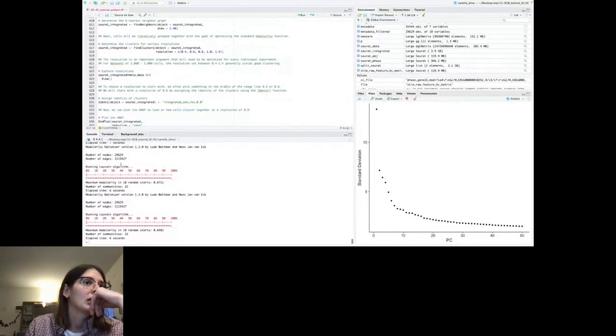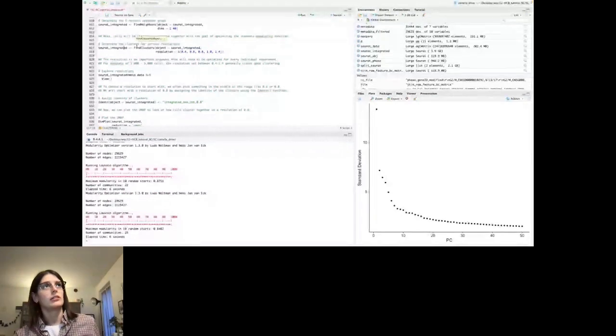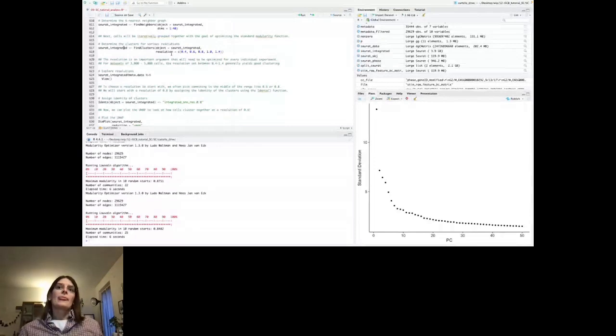So, perfect. Just one thing that I should say. The resolution parameter is very important because it decides, as I was telling at the beginning of the tutorial, the granularity of the clustering. So the constraint to say that one cell belongs to one cluster or another, are they relaxed or are they more strict? Do I end up with just one single cluster encompassing all cells, or do I end up with one cell, one cluster? This is the parameter to set.